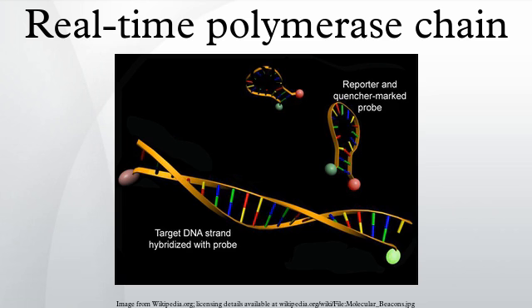However, research has shown that amplification of the majority of reference genes used in quantifying the expression of mRNA varies according to experimental conditions. It is therefore necessary to carry out an initial statistically sound methodological study in order to select the most suitable reference gene.